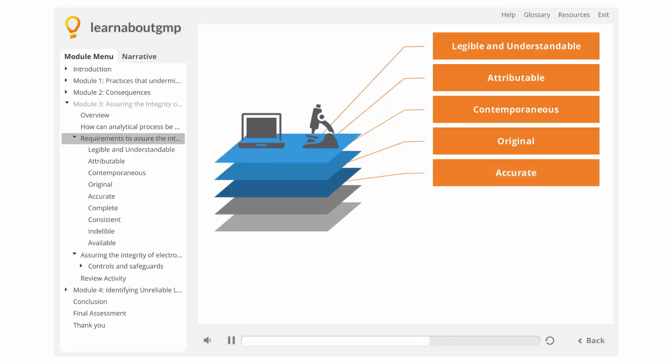Accurate. No errors or editing without documented amendments. Complete. All the information and data associated with the analysis is included.